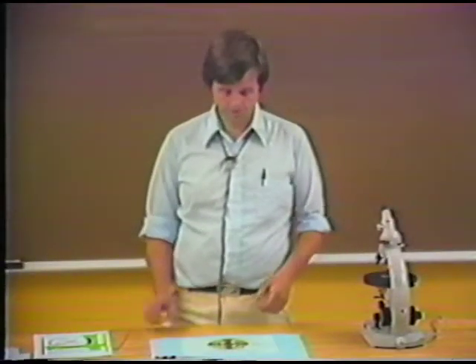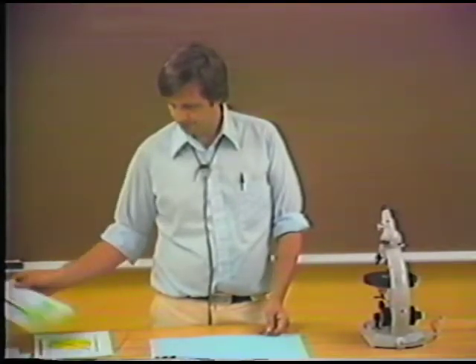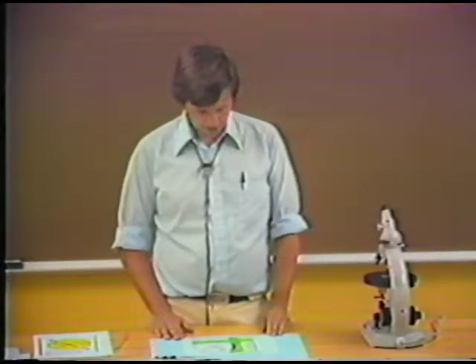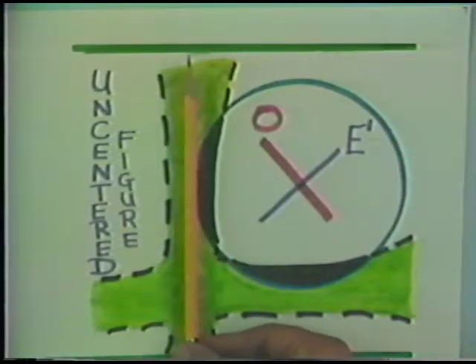The only trouble is that these kinds of figures are not particularly common. A much more common kind of figure is the uncentered figure. And this is a schematic view of the uncentered figure. If you watch an uncentered figure closely, you will realize that as the figure moves, and what I've represented here is the field of view, you see successive traverses of both isogyres.